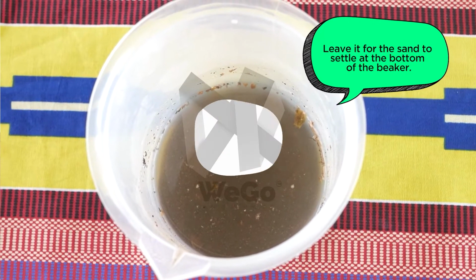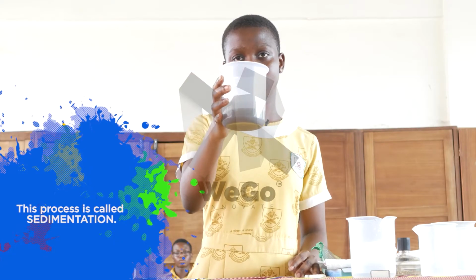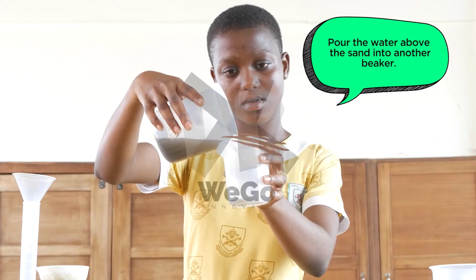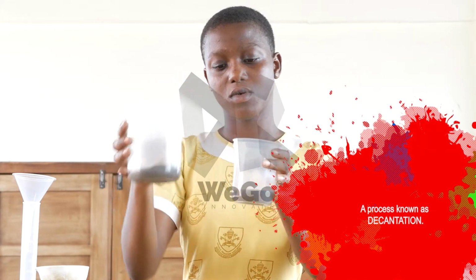Leave it for the sand to settle at the bottom of the beaker. This process is called sedimentation. Pour the water above the sand into another beaker, a process known as decantation.